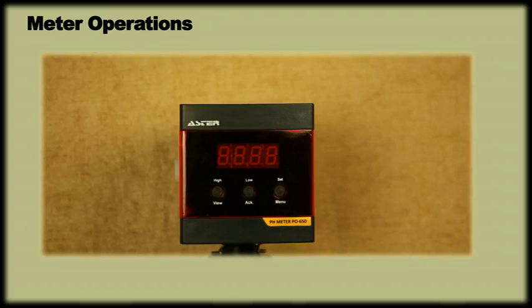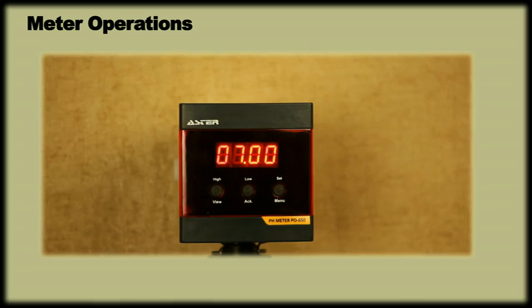Meter Operation: Let us now learn the operation of the meter. By turning the meter on, the display will show the company name, type, version and output. As you can see, it has three programming keys, view key, acknowledge key and menu key.